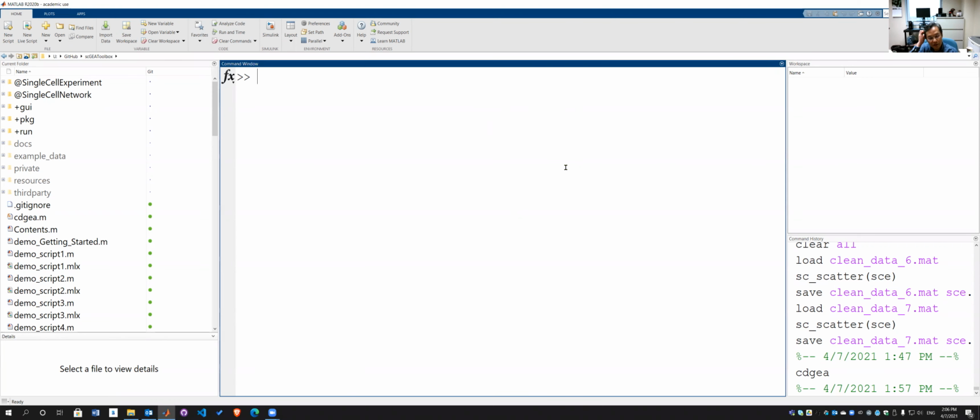Okay, so we have some leftovers from last week. I didn't show you how to use gene regulatory network analysis. So this time I'm going to need you to go through that analysis, and then I will leave the rest of the time for yourself.